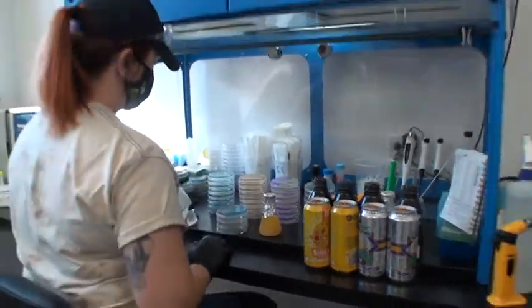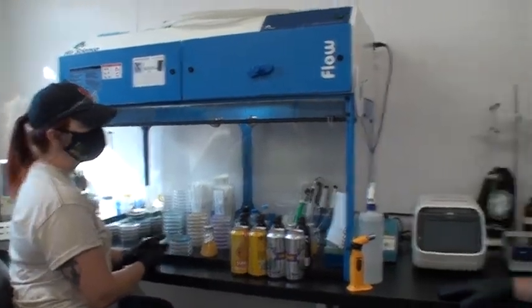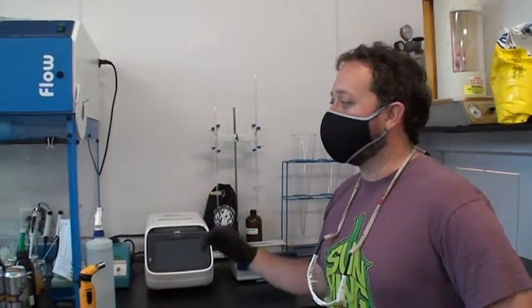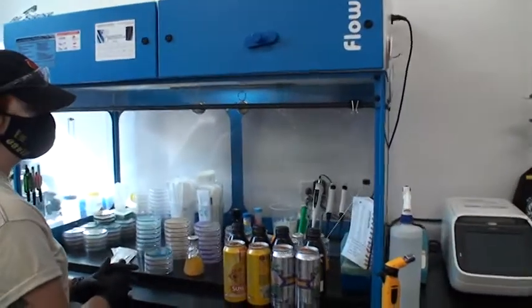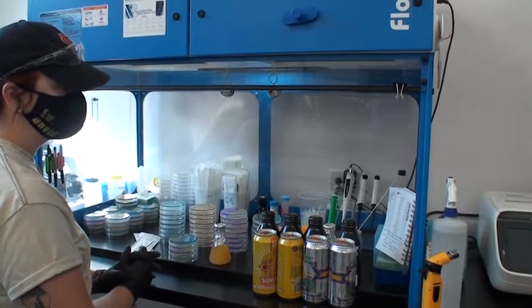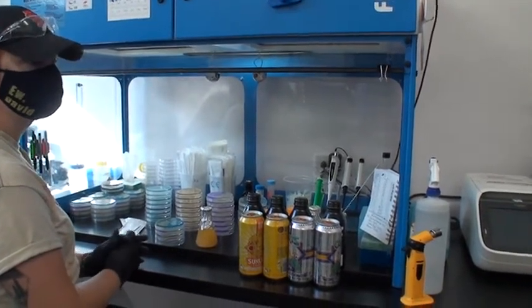Today we're doing a round of plates. We plate every beer at least four times during fermentation — from day one of fermentation to packaging, every beer is plated at least four times. We do this every day: fresh beers that were brewed, beers transferred to bright tanks, beers that are canned or kegged. They get tested at some point during the week, every day of the week pretty much. So you test every beer at every stage? Every stage, exactly.